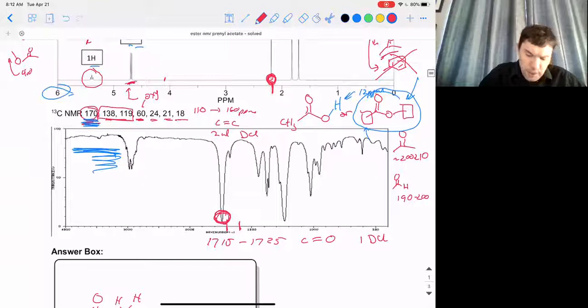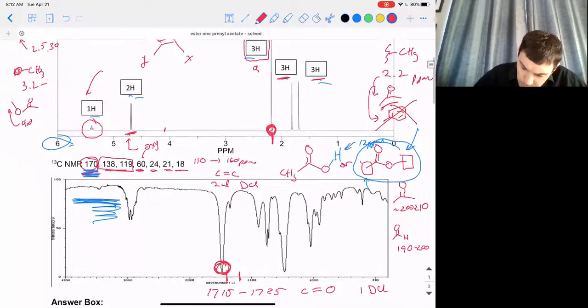But this one's dragged even further down. Not only that, these methyls over here are nowhere near that 0.9 range that I gave you before. They're all the way above 1.5. They're at 1.6, 1.7, 1.8, somewhere in that range.